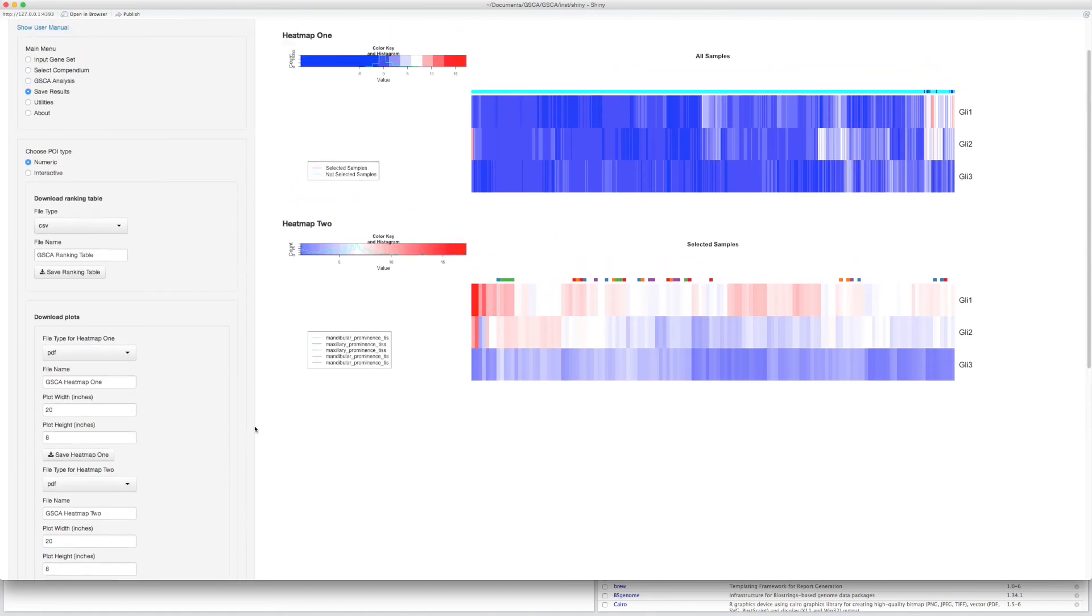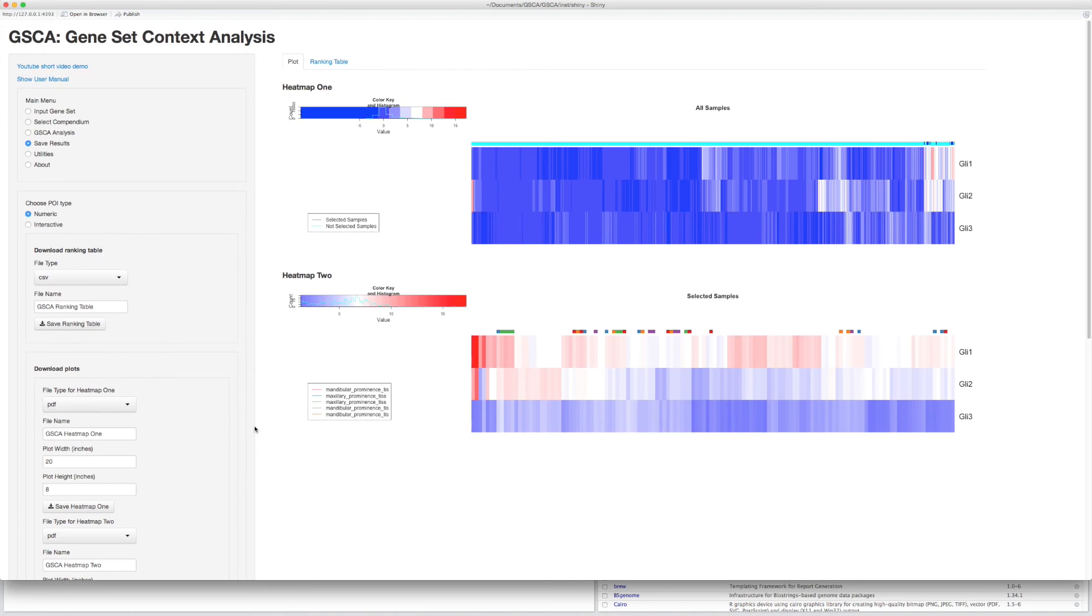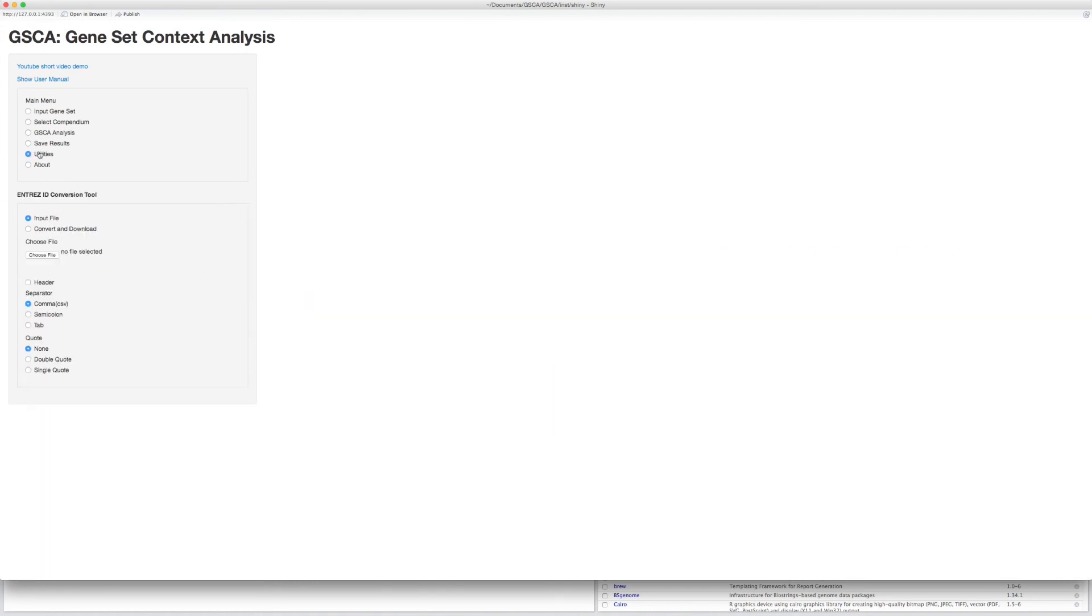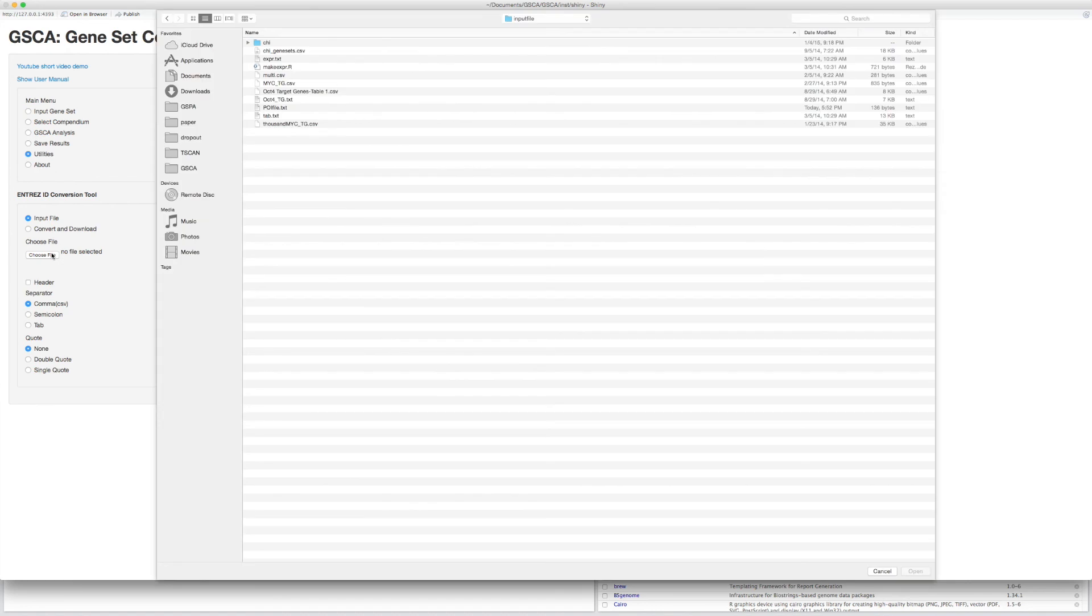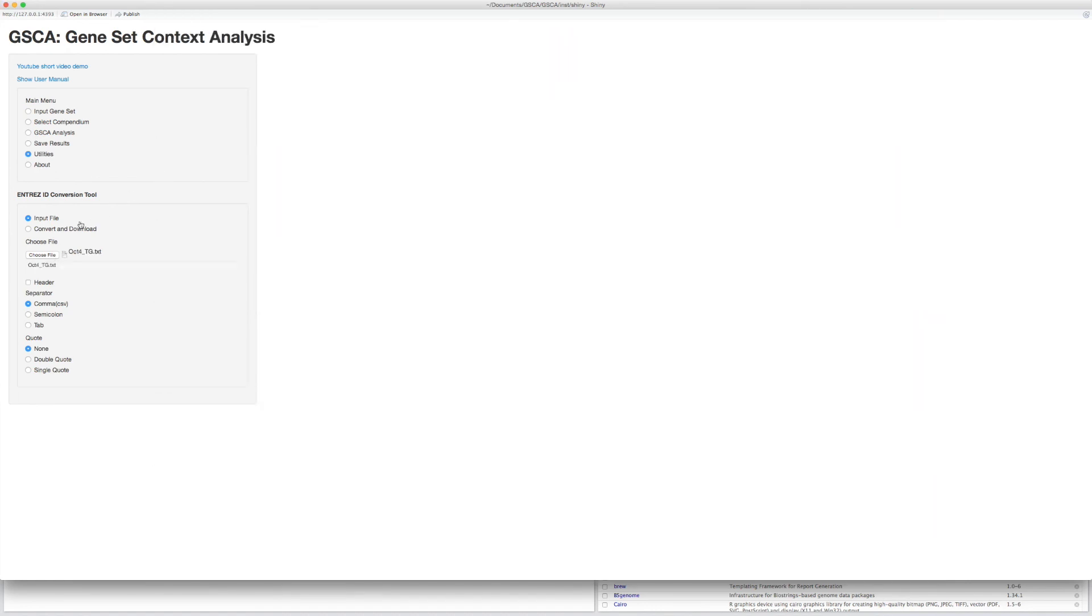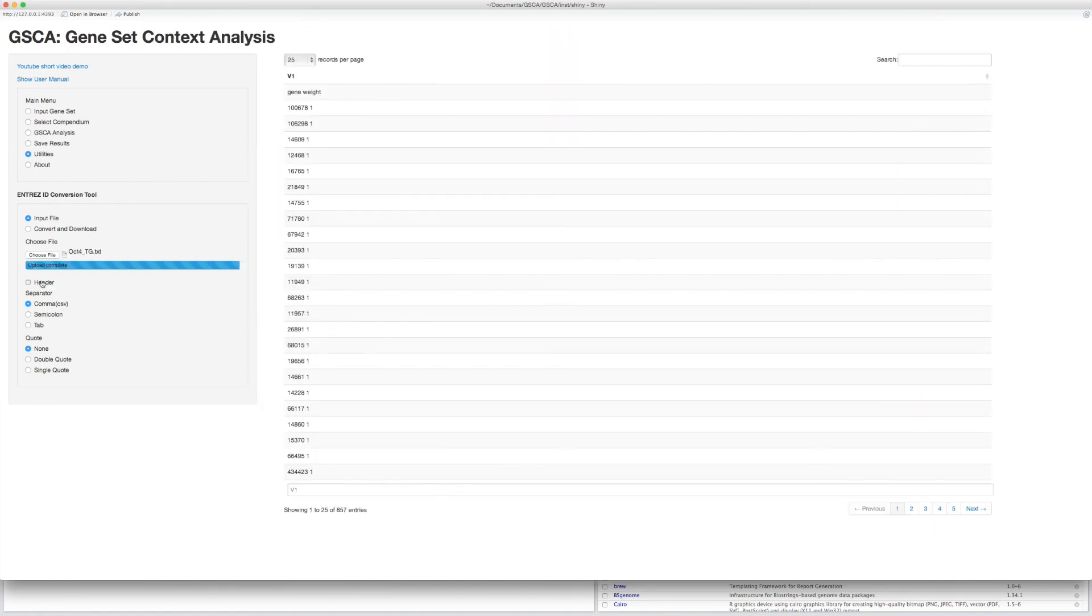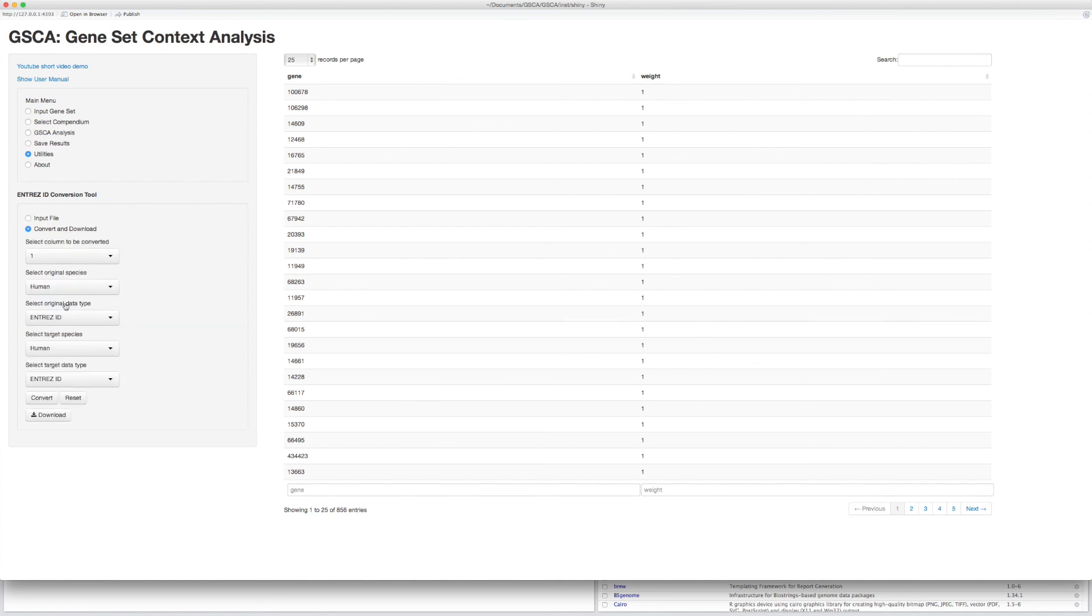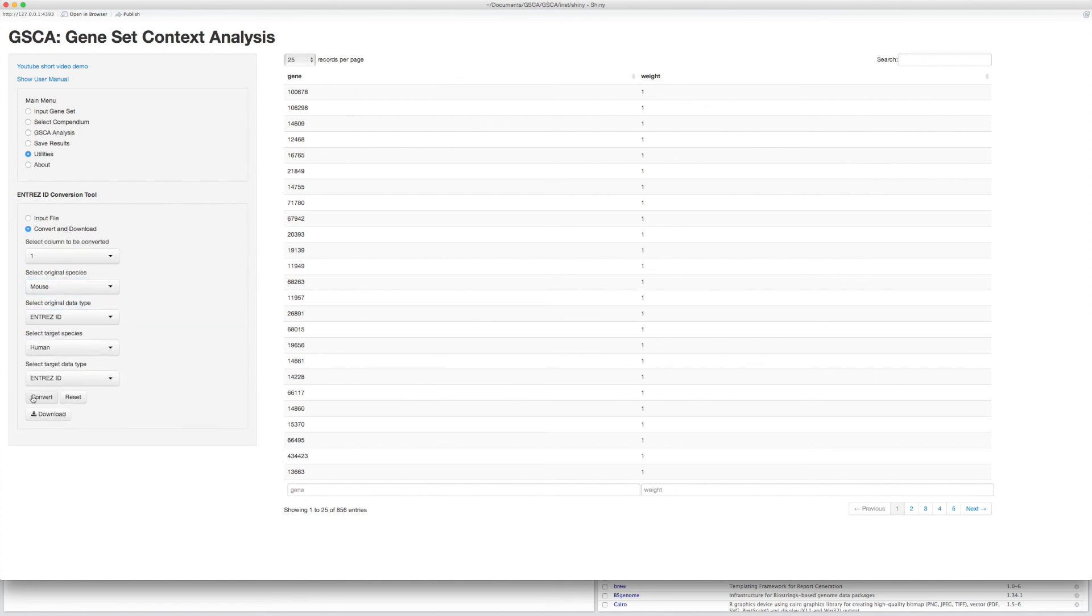To perform cross-species analysis, GSCA also provides a handy tool to transform Entrez gene ID between human and mouse. For example, I want to convert the mouse Entrez ID to human Entrez ID. The conversion is completed. Click the Download button to save the file.